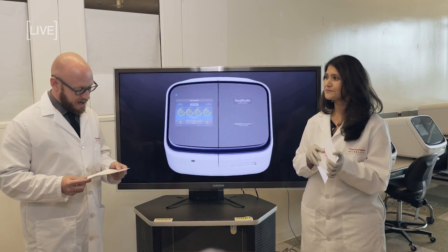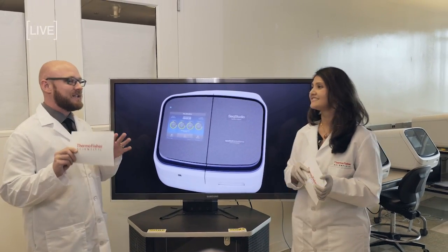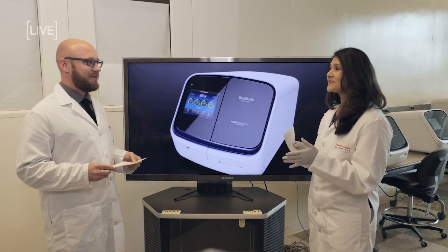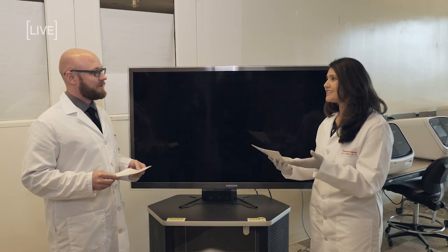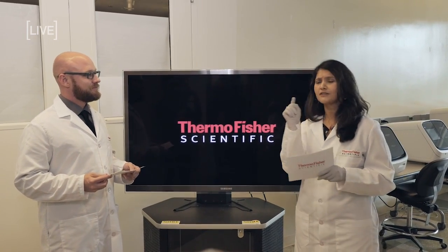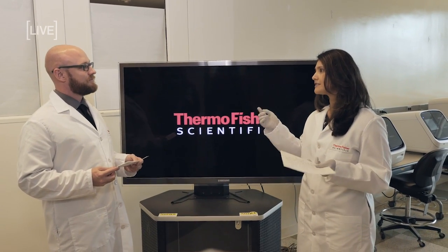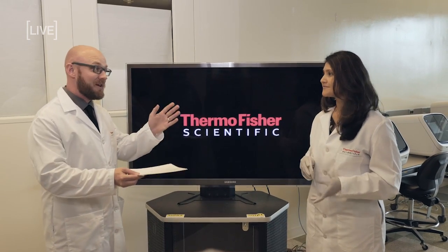Okay, sounds good. Now switching back and forth between fragment analysis and Sanger sequencing, something you can definitely do in the SeqStudio, but how difficult is that? It's actually not that difficult, and it's funny because I actually had a chance to play with it, so I have first-hand experience. You can do it when you're setting up the run, so the customer can tell the instrument which sample is Sanger sequencing versus which is fragment analysis. And the great thing is it all runs on the same plate at the same time. Right, as seen in the demo video with you.